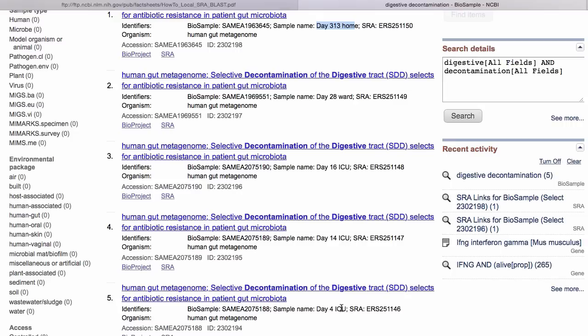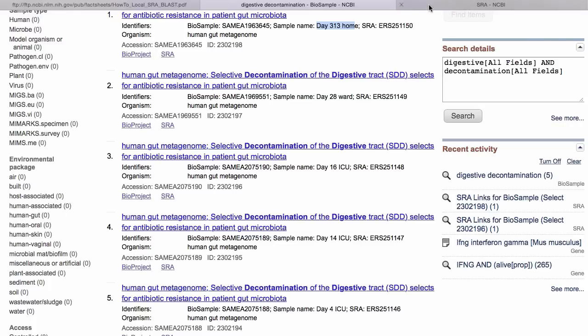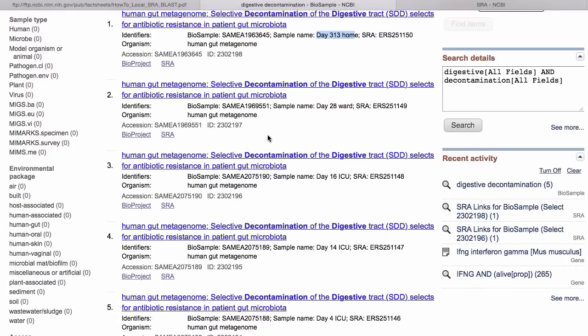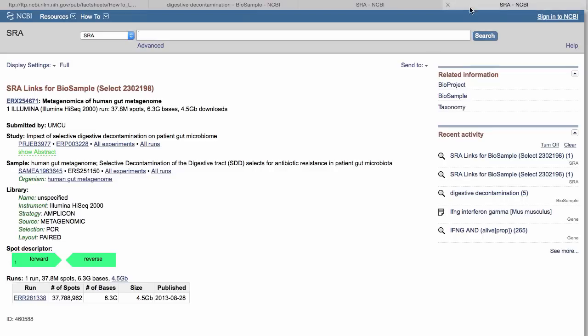I'm going to examine 16 days in ICU and at home. I'll use the SRA links here, and looking at the SRA pages I can see the run accessions — that's the run accession for the 16-day ICU, and I can find the one for home here as well.